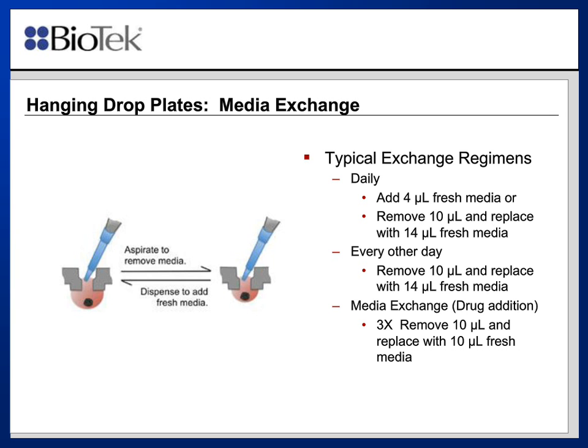And then just prior to a drug addition, you may want to more thoroughly wash your spheroid, and so we can do multiple removals and replacements of fresh media.